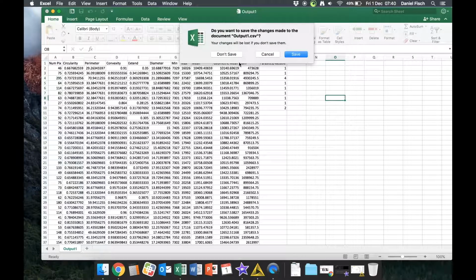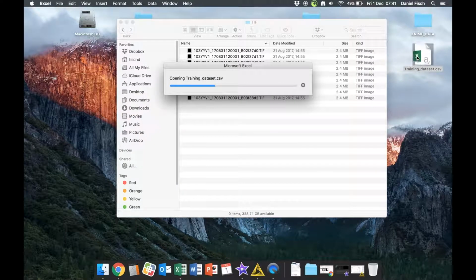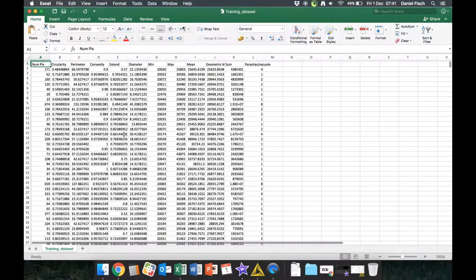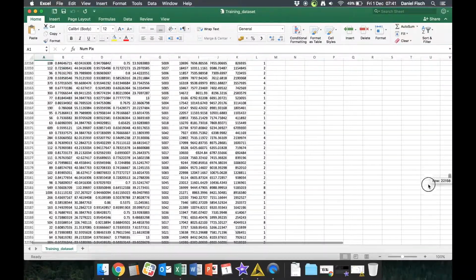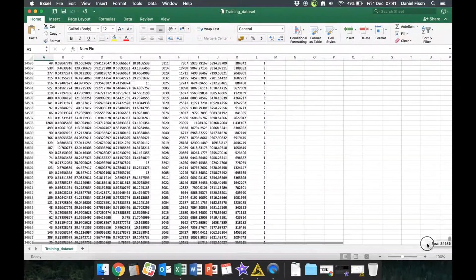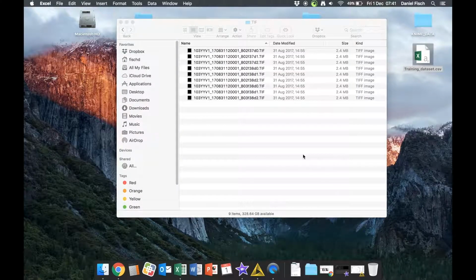And just to give you an example, when I'm running HRMAn on my computer, this is my learning data set for Toxoplasma infection, and you can see I not only have 200, but if we move down, something like 35,000 vacuoles annotated, and this usually results in really, really good classifications.